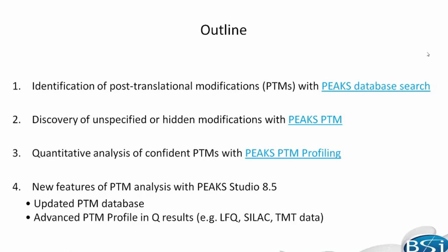The next thing I'm going to talk about is some quantitative analysis when it comes to PTMs. So we have this new tool within PEAKS called PTM Profiling. I'll go over how that can be used to help you find out the similarities and differences in PTM amount between samples. And then I'll talk about some of the new features in 8.5, such as our updated PTM database and some advanced PTM profiling within quantification results.